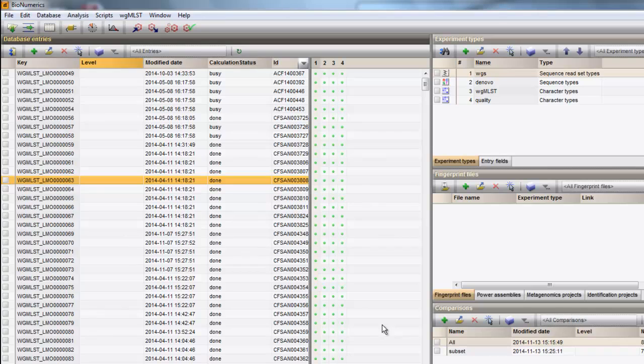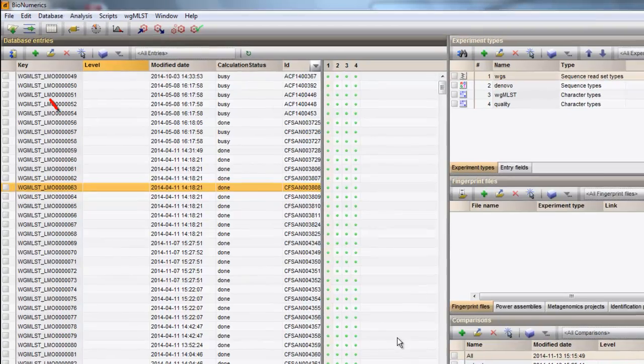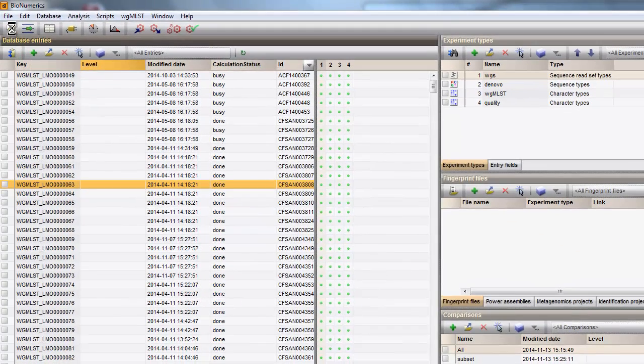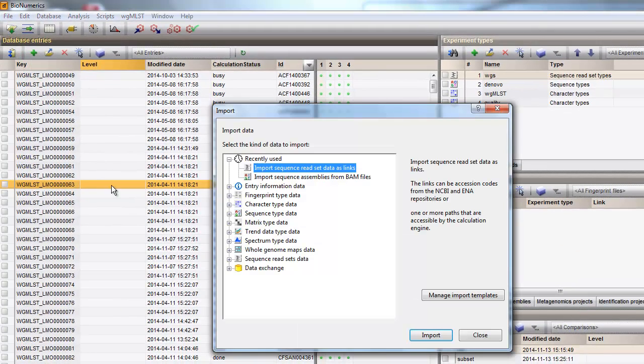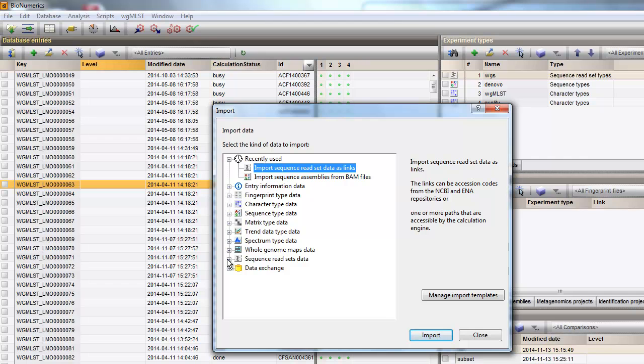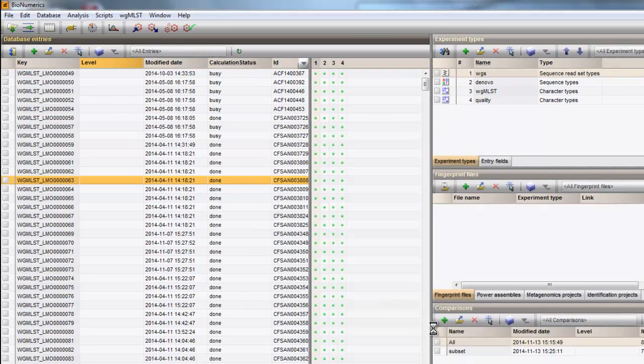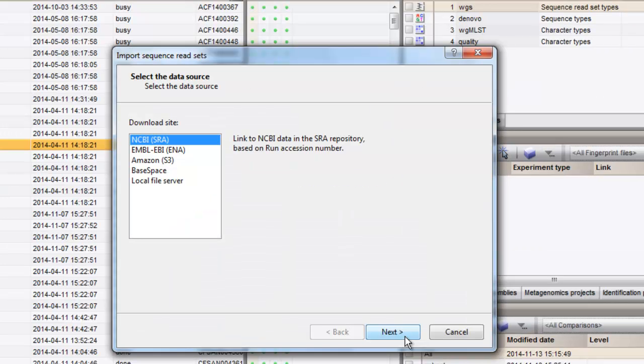The way to proceed then is to follow the import wizard to sequence read set data, import sequence read set data as links. Here you have an overview of the available data sources where you can link to. Depending on the choice of import, other parameters may be required in the import sequence read set dialog box.